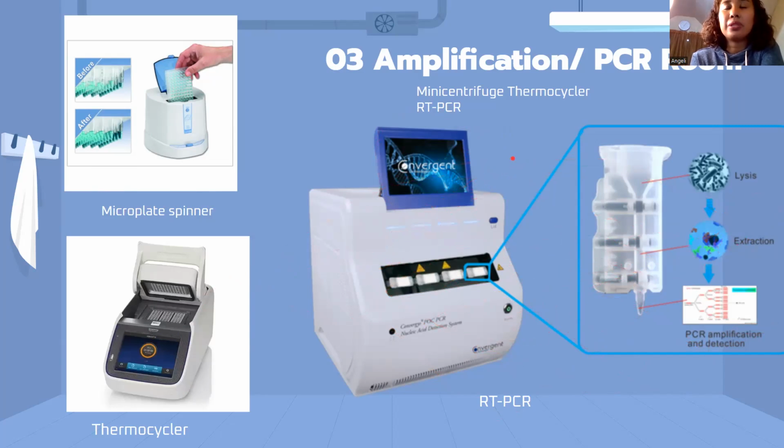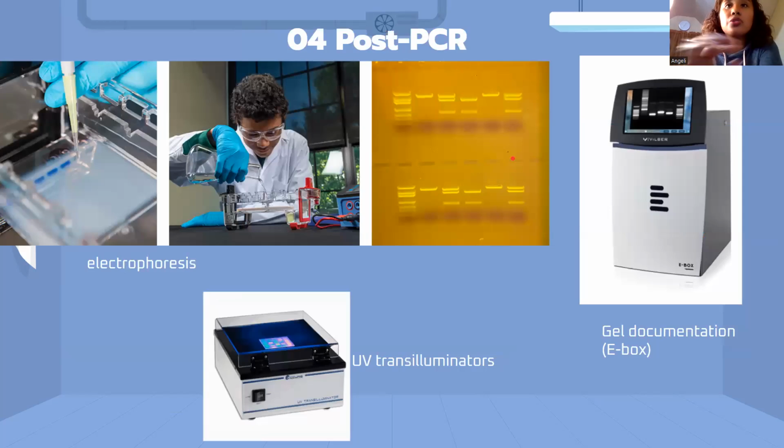The copies number in the millions, so we are not yet at UV. In AO14, there is no post-PCR room, only in ours. We will perform gel electrophoresis, so you should be good at pipetting because this is late. We have a gel documentation box. I was confused by our gel documentation box, it is very high-tech now, but it started just like this, as UV transilluminators. Both have UV. This ultraviolet light will make your fluorescent stain more visible.